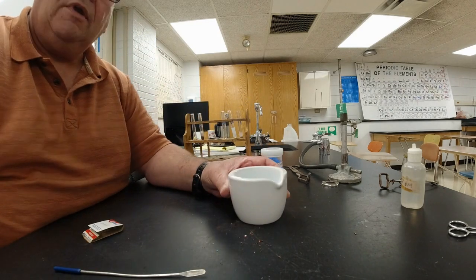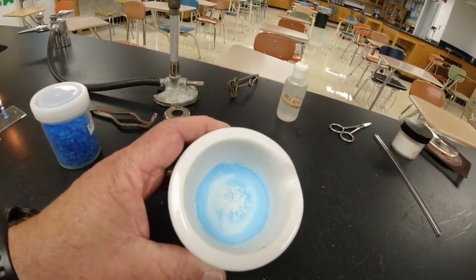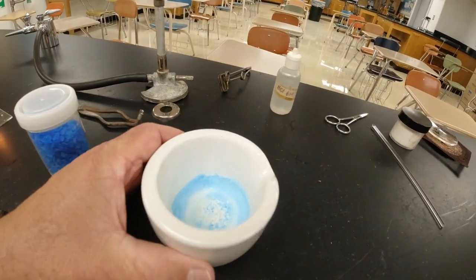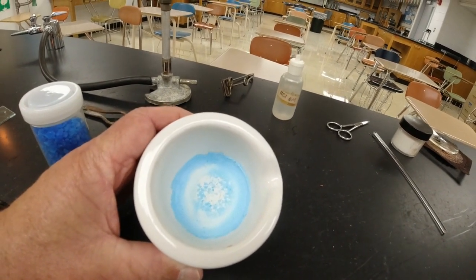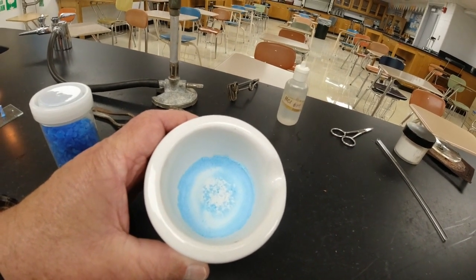All right, so now what I have left in there is not nearly as dark a blue crystal. You know, there's our crystals from before. They're darker, and this looks a lot lighter. Now, that color change might suggest to you that there was some sort of chemical change that took place, but keep this in mind. What's the color of an ice cube?